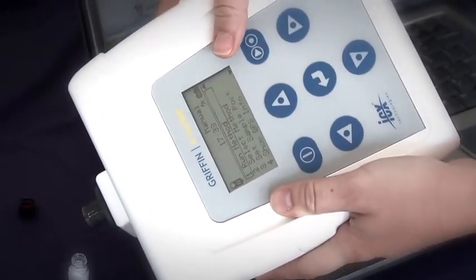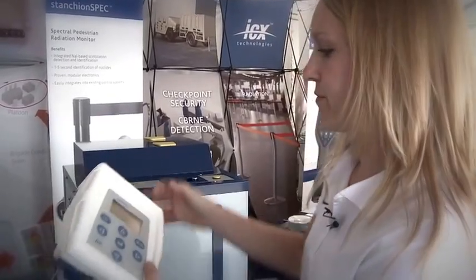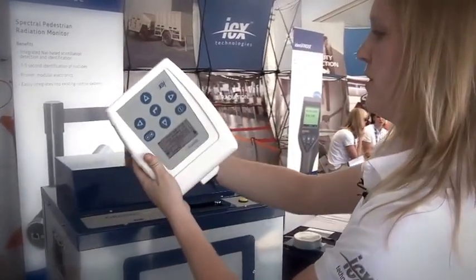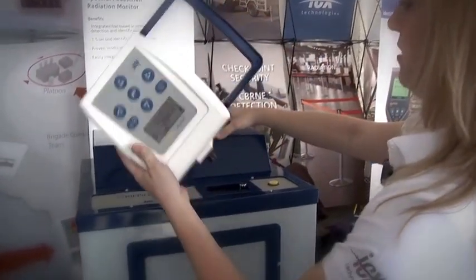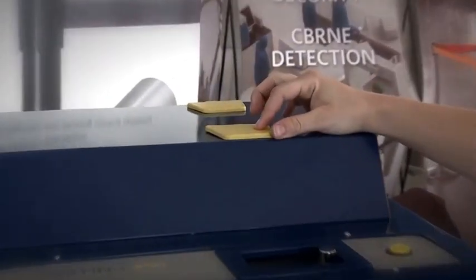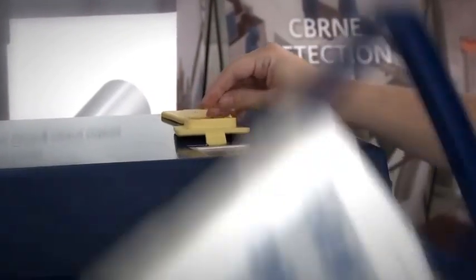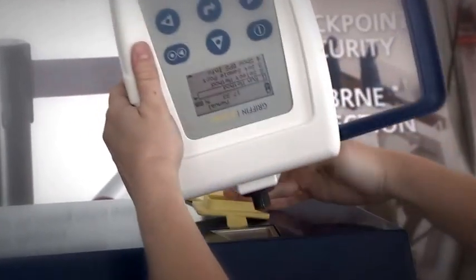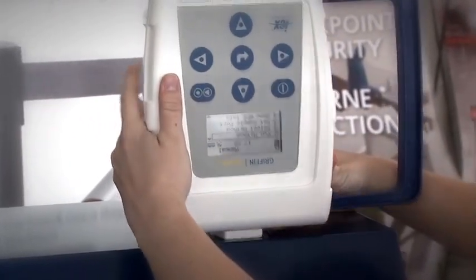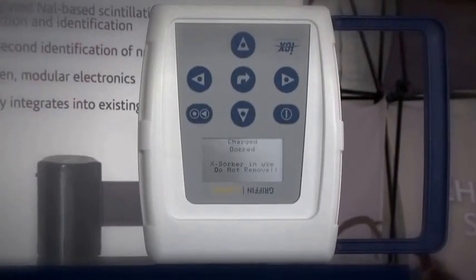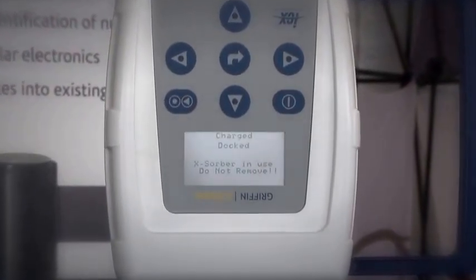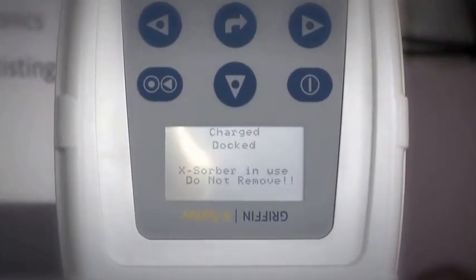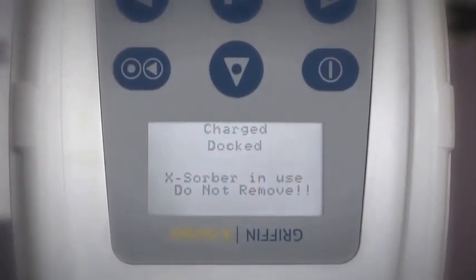Now we're going to take the Xorber over to the mobile GC MS and analyze the sample. To do that, you open the handle, open up the sampling port on the Griffin 450, and insert it. There's a triangle here, so you line up the shape with the display facing you. You can see it says charging docked. While you're working with the instrument, it does recharge the battery.